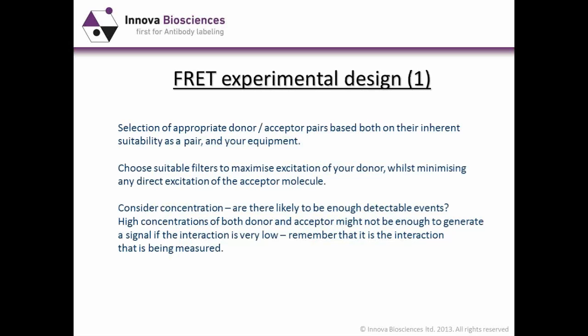In terms of experimental design, there are a number of general things to consider. Obviously, one of the key factors to consider will be what base application you're working in. In terms of base applications, I mentioned applications such as ELISA and microscopy earlier on, and obviously your experimental design will depend upon which of those you're using.